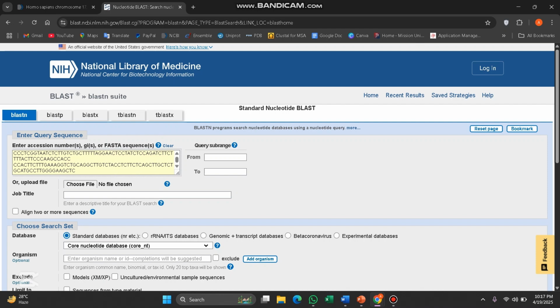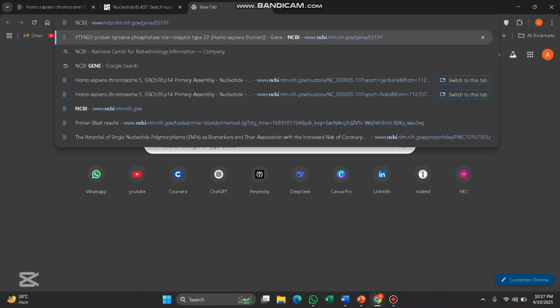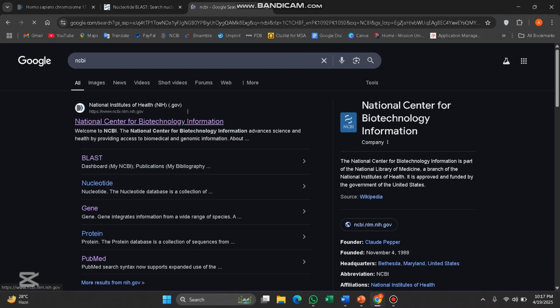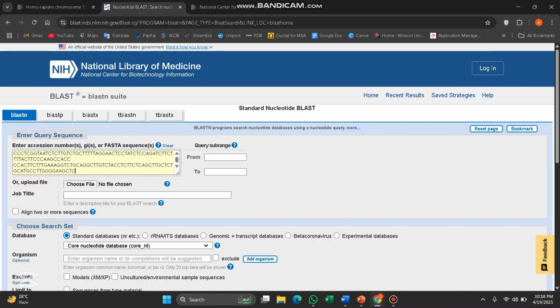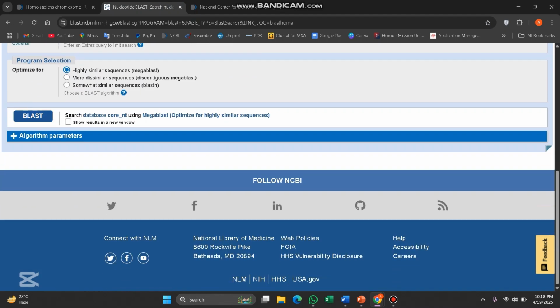In the regular NCBI search, we just use BRCA1. There we know the species, the gene, the nucleotide, but we want the sequence. But if you have a sequence, you can also find out about the species and gene. So just click on BLAST.